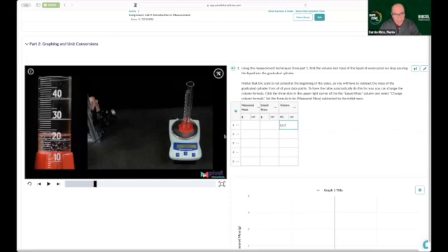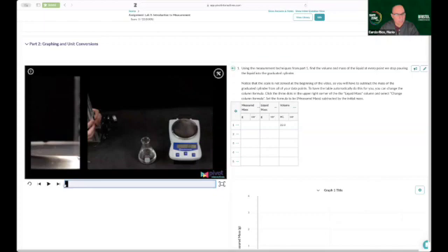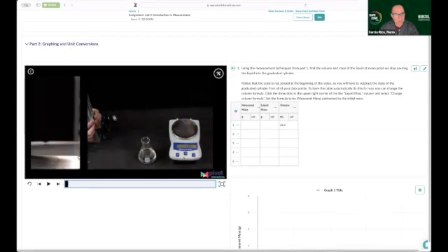Now, please notice that I actually went ahead and skipped the very first reading, which, if I go back, I'm going to see that at the beginning of the experiment, there is absolutely nothing in the cylinder. It's an empty cylinder. But there is a mass that the cylinder weighs. Let's go back a little bit. 0 grams.